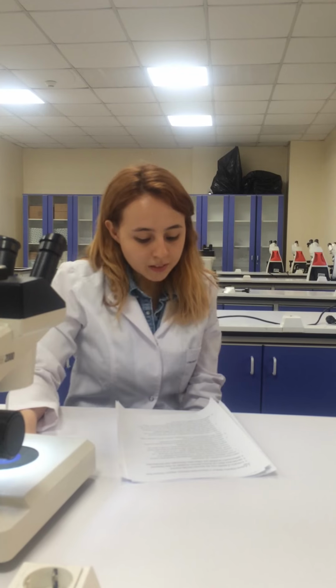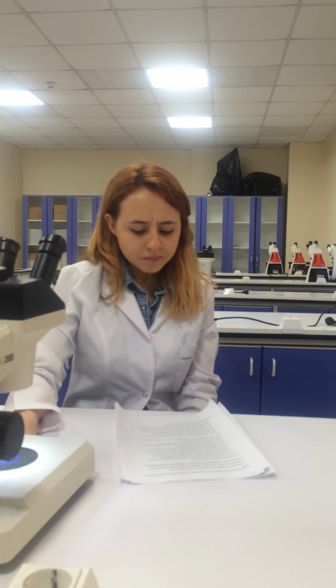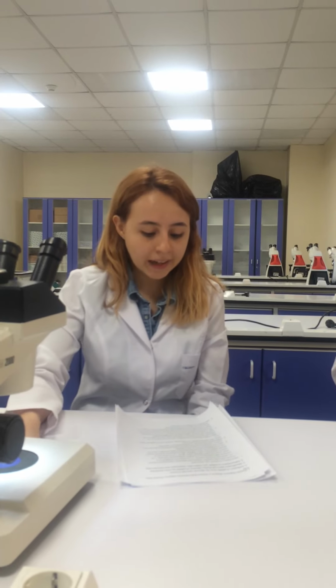After 3 days, the adipose induction medium is removed completely. 3 milliliters of adipose maintenance medium is replaced every 3 days. Major adipocytes will be terminally differentiated by about 9 days after. Over 90% of adipocytes are well differentiated using this protocol. These adipocytes are ready for staining with Oil Red O stain.